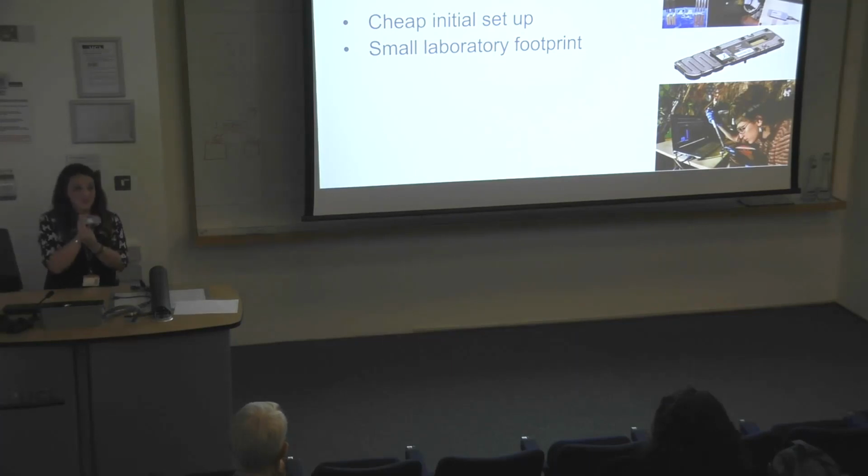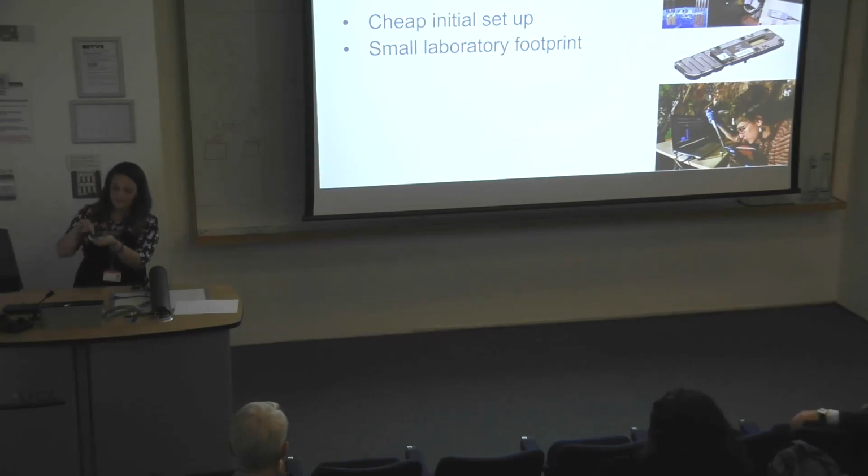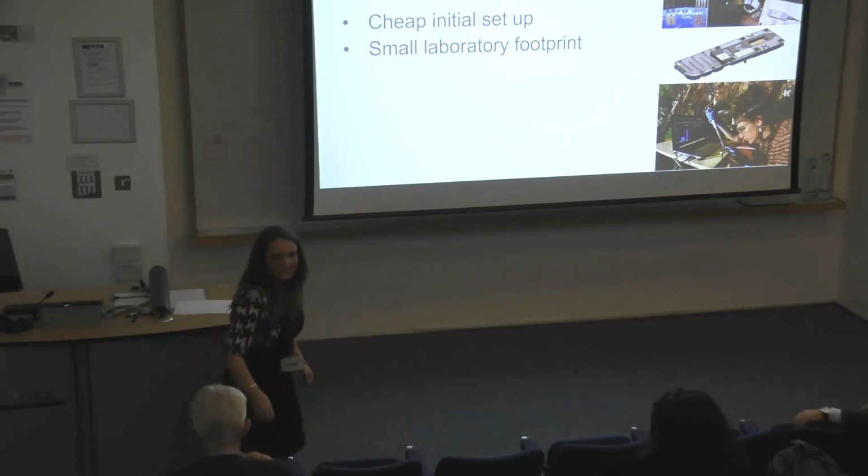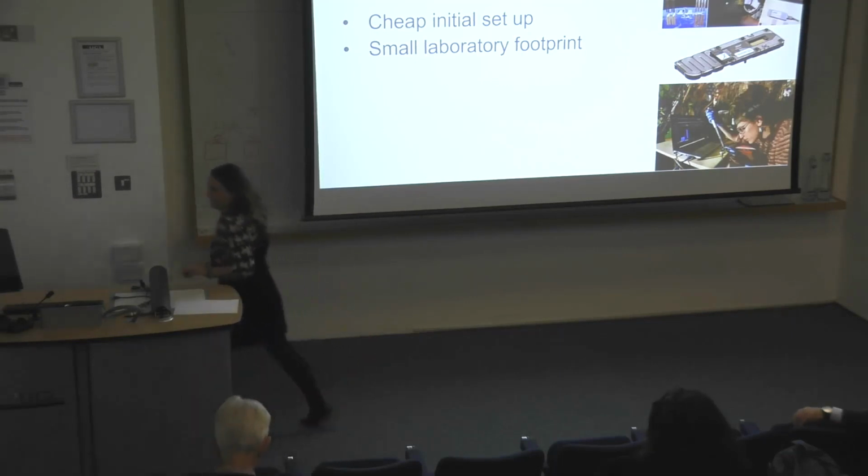Neil said it would be fun to do a show and tell, so I might send this round. It's also got a flow cell in it, so the device itself is the MinION, and then the little black bit on top is the actual flow cell where the sequencing takes place. So just pass it around. You can take this on my camera.